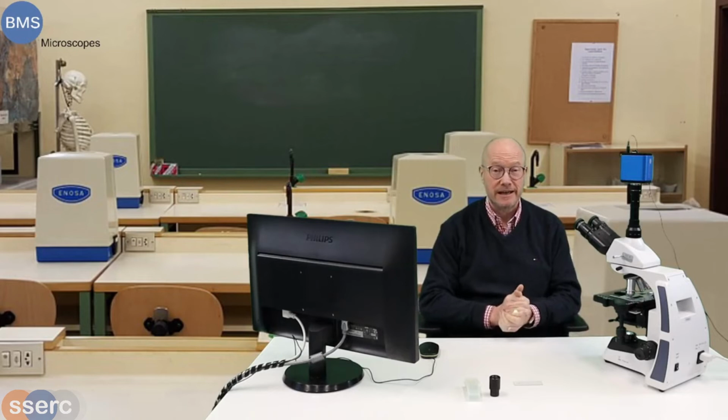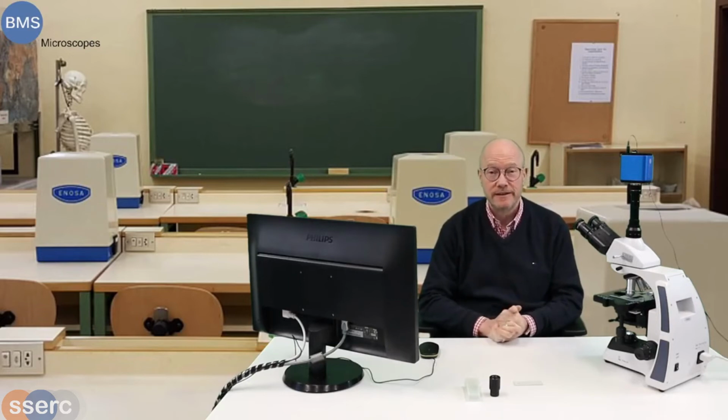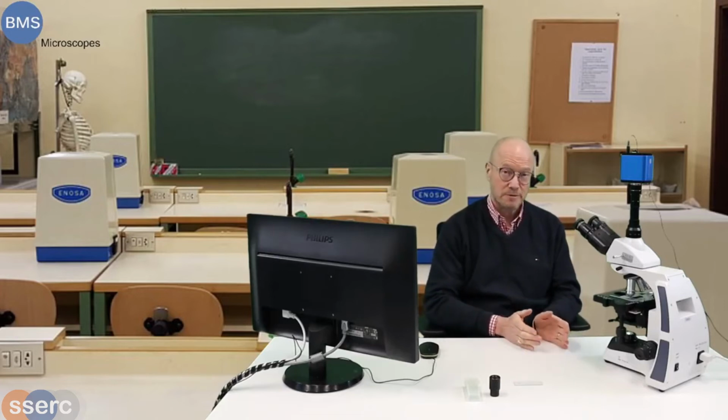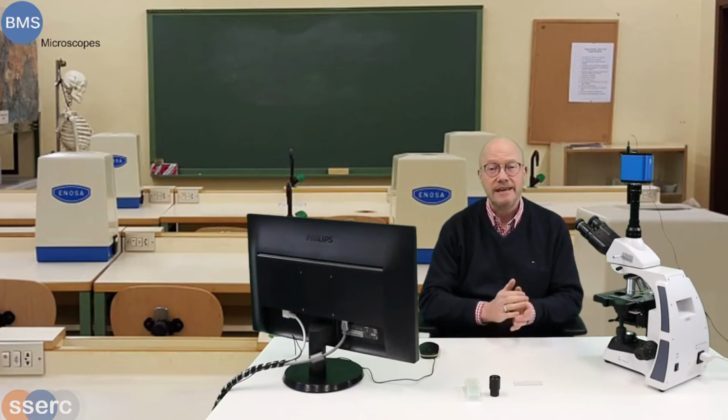Right, we see now how to manually calibrate the microscope. And of course, we would like to do some recordings also, and we have cameras for that. And fortunately, the camera software also has measuring programs. And I'm going to show you now how to calibrate that measuring program, BMS Pix3. That's the software that accompanies our cameras. Of course, we have to do this again per objective. As I stated earlier, each objective has its own magnification, and for each magnification you need a calibration.